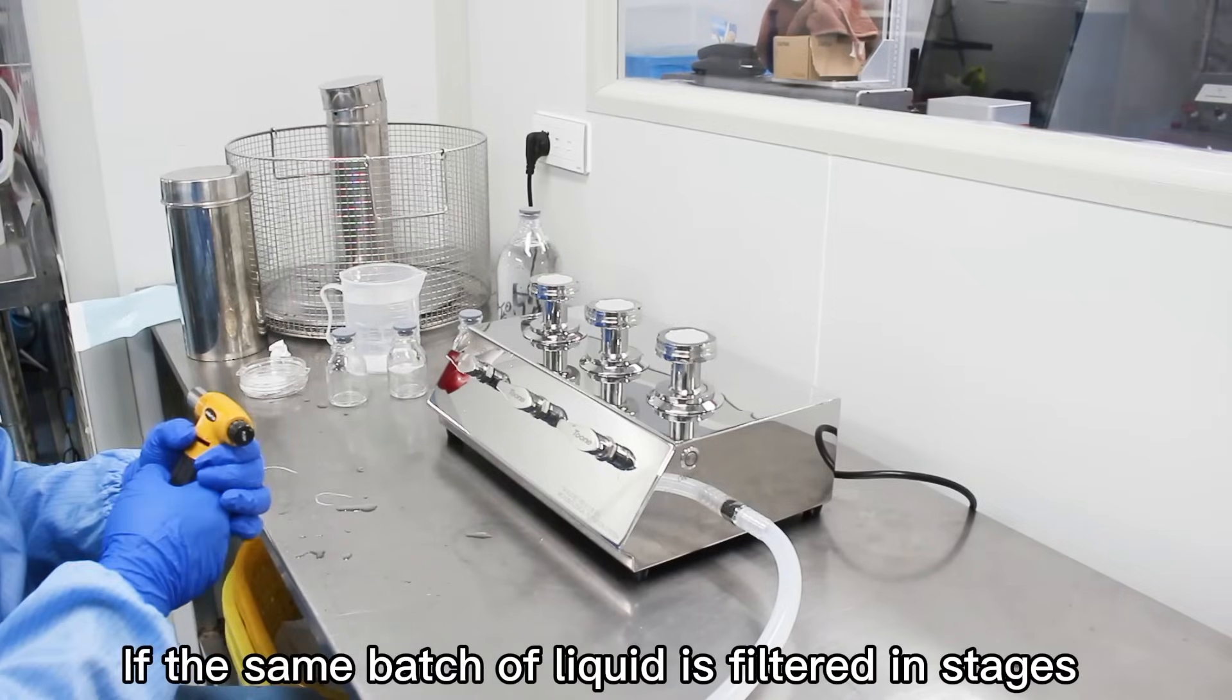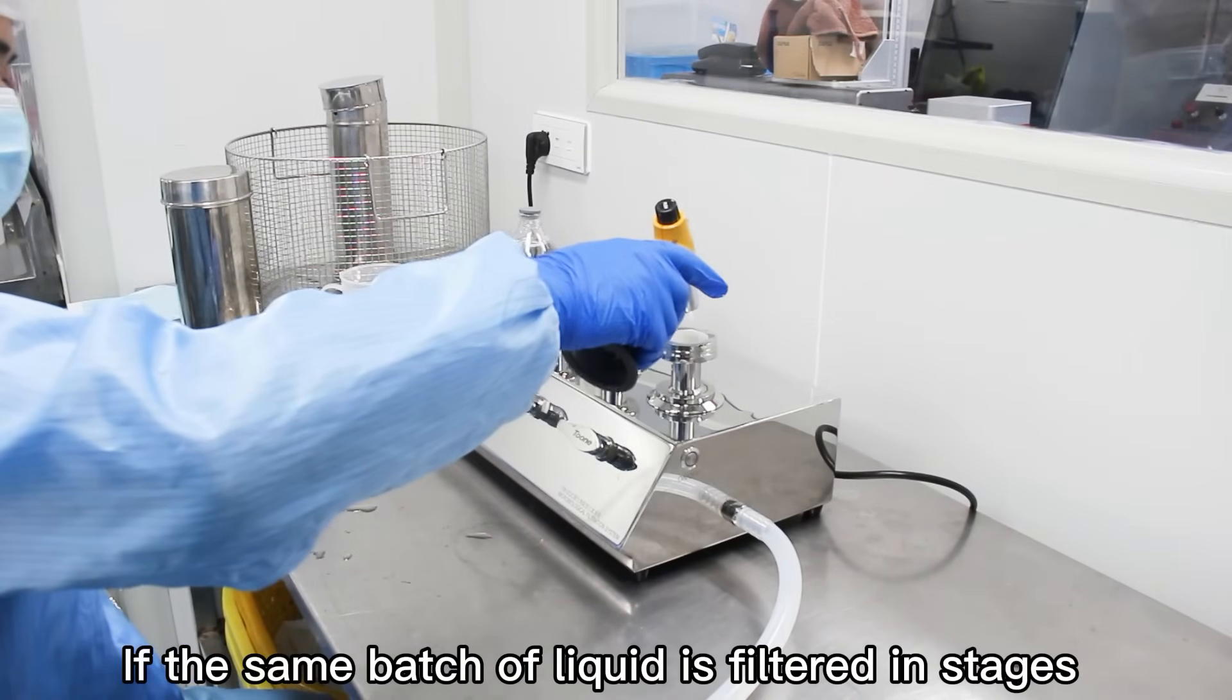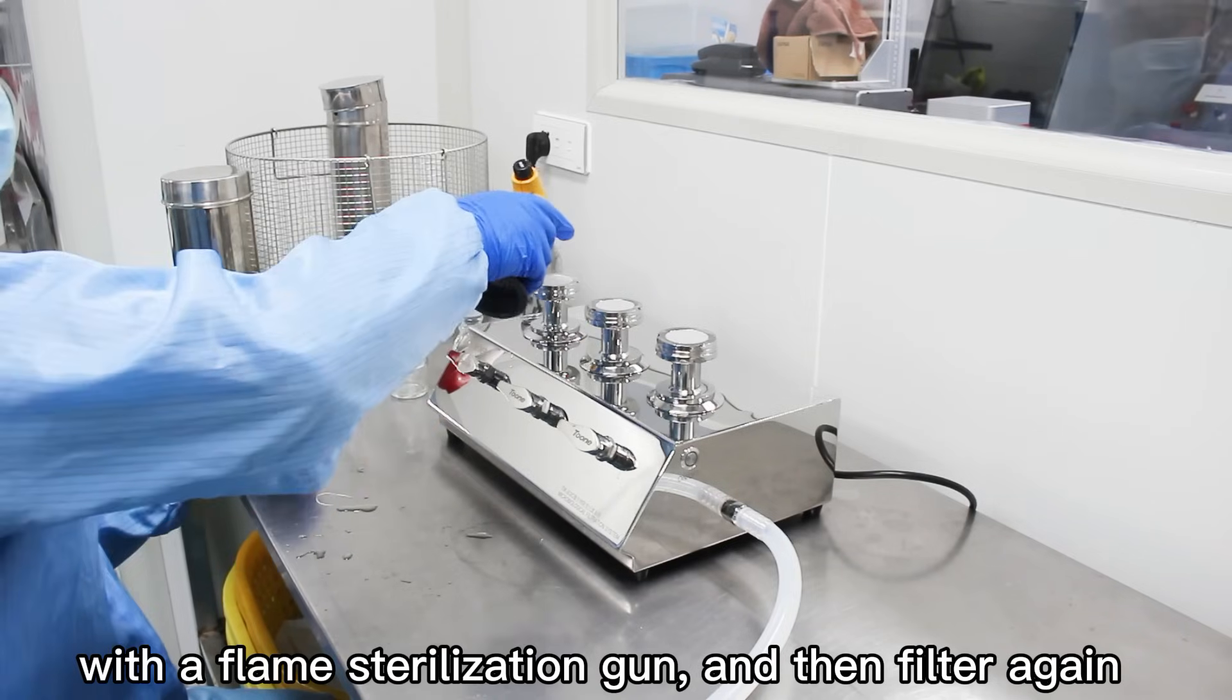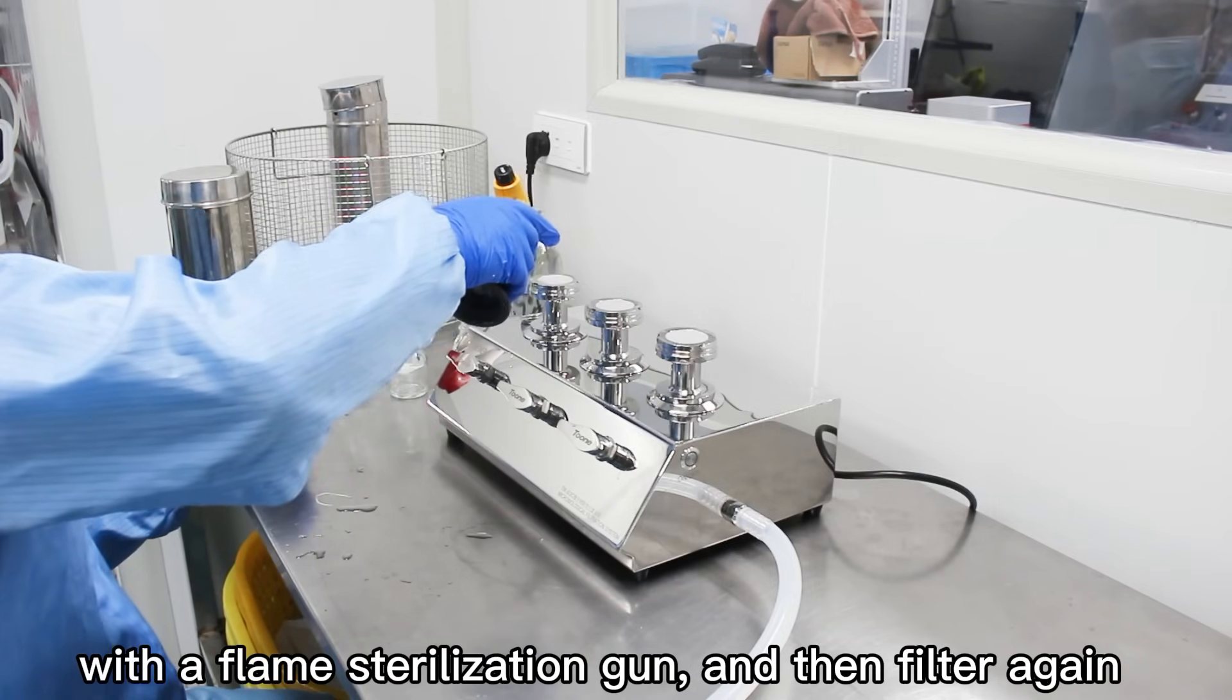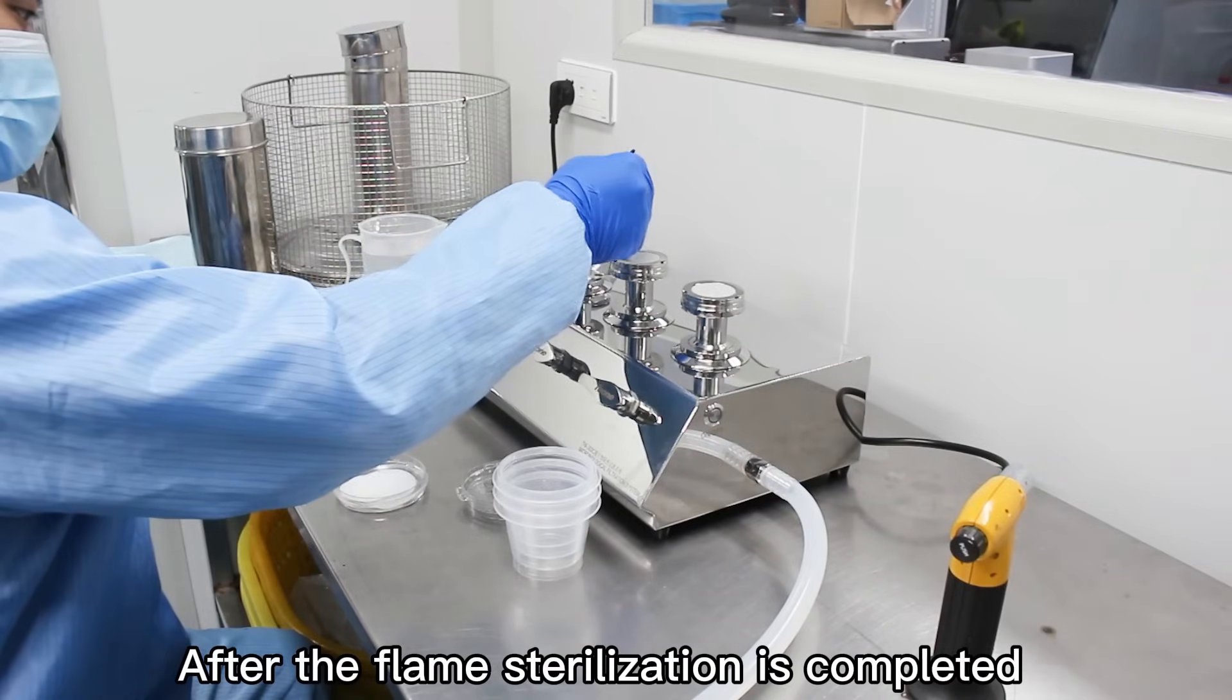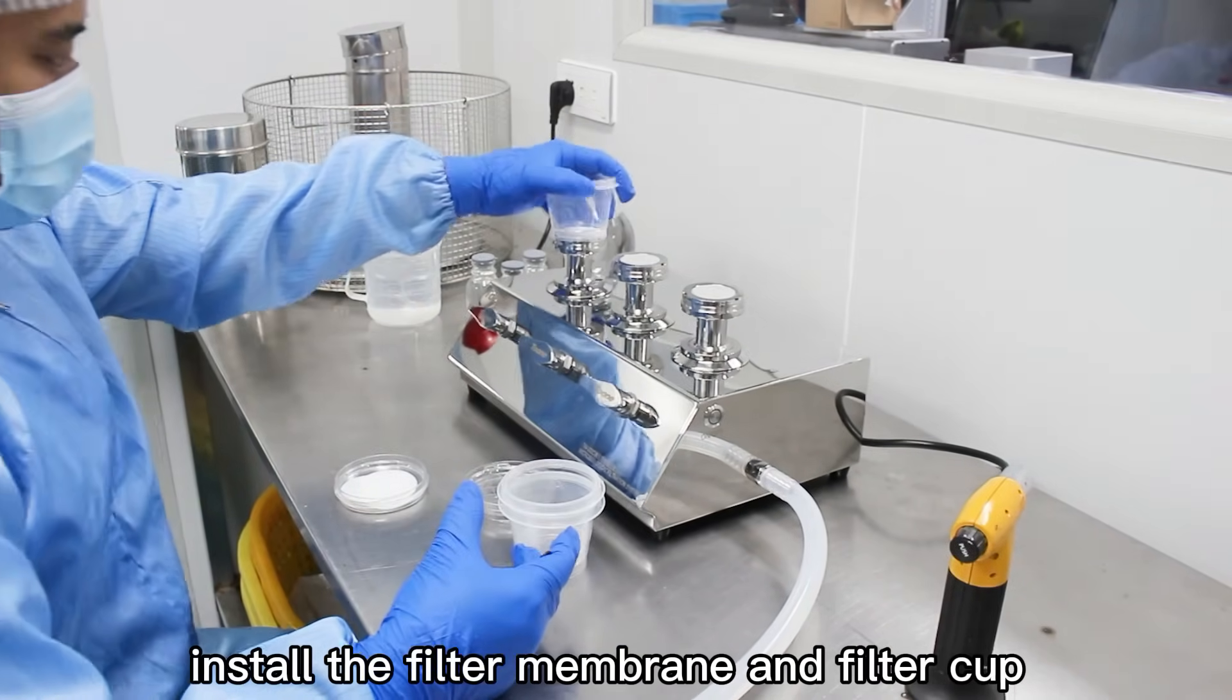If the same batch of liquid is filtered in stages, sterilize the stainless steel base directly with the flame sterilization gun and then filter again. After the flame sterilization is completed, install the filter membrane and filter cup.